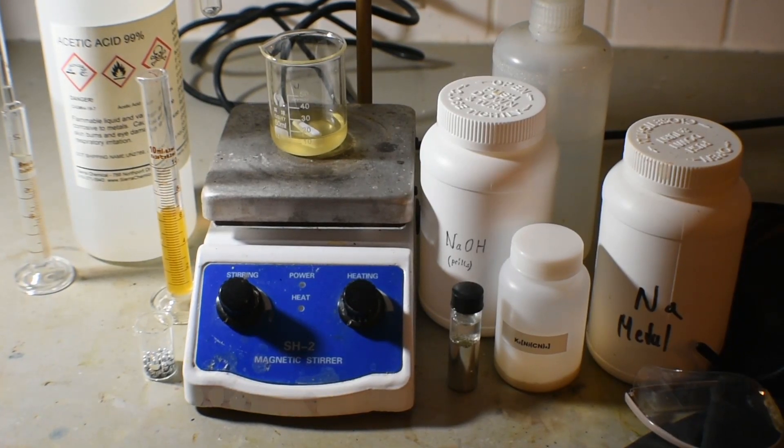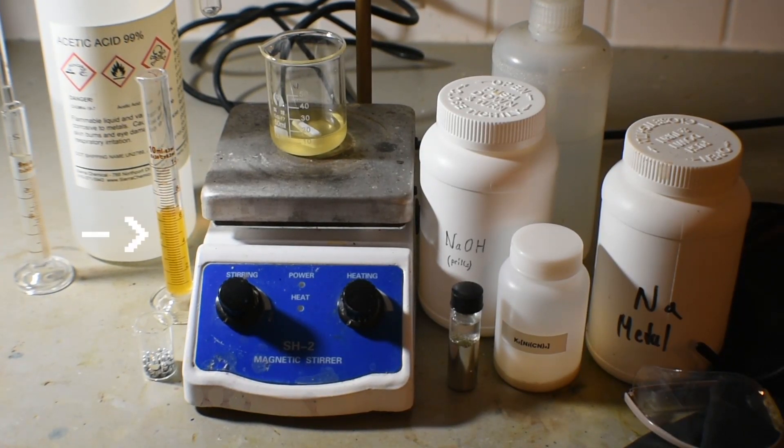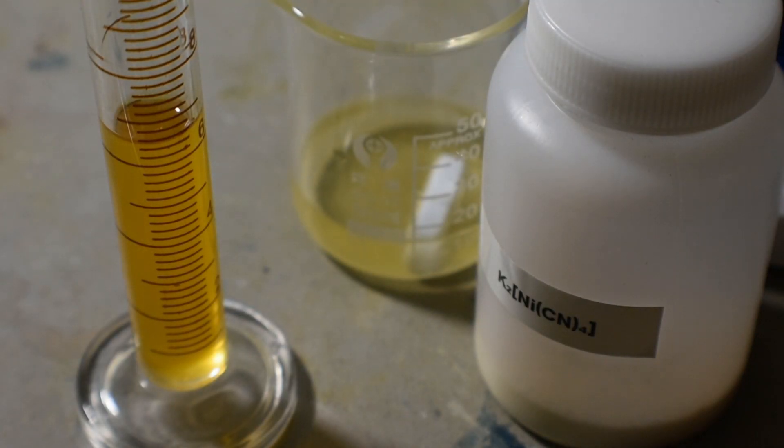First, let's look at what we're going to be using today. You can see a yellow liquid there. I'll start by crushing your hopes. This isn't urine. Instead, it's a solution of potassium tetracyanonicolate, which I made by reacting nickel-2-cyanide with a solution of potassium cyanide to form this nice, yellow-colored solution.